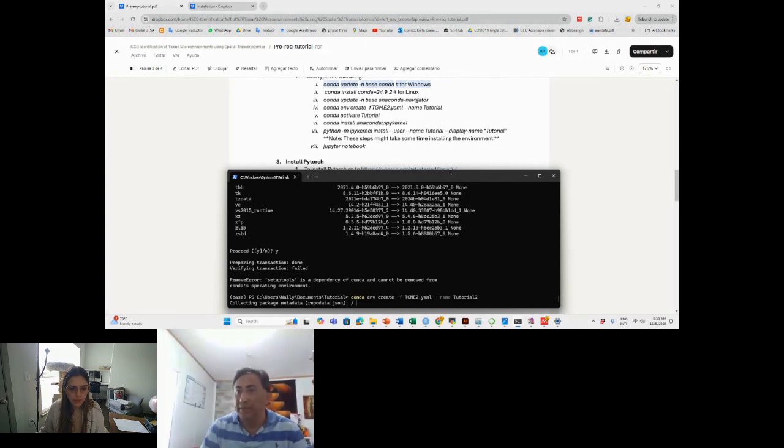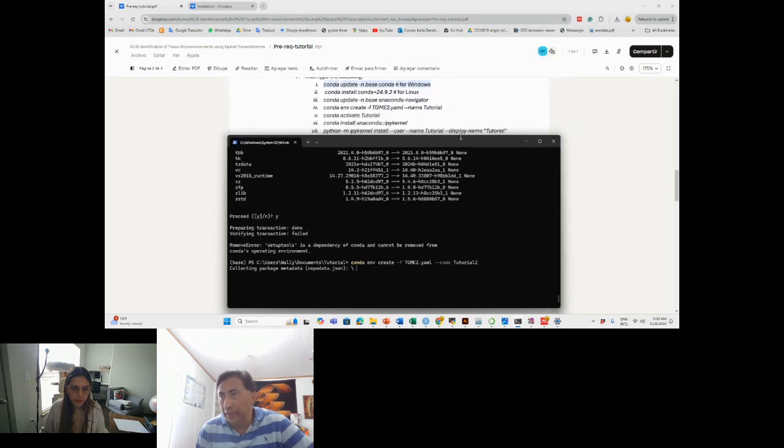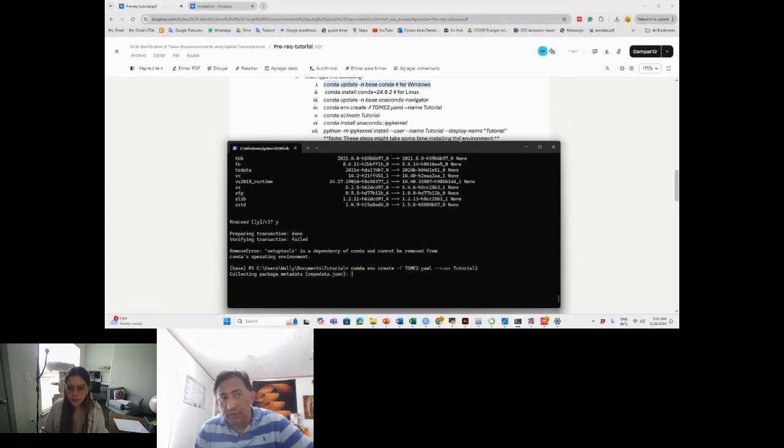So what is happening here is you're installing the same libraries that Carla used so that they are compatible and you don't have any incompatibility problems. Carla spent some time providing this. It is a great way to transfer your work, and the person that you're sending this code to can run it without having to spend a lot of time figuring out what the problems are with the different versions.